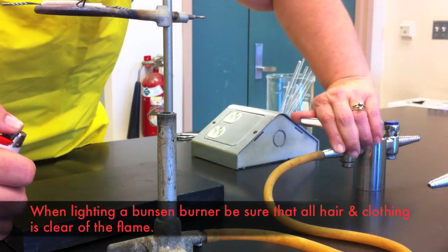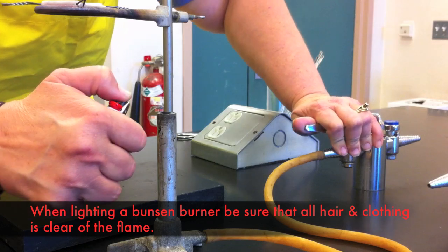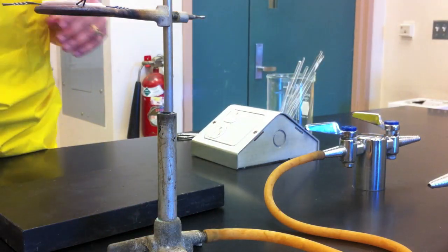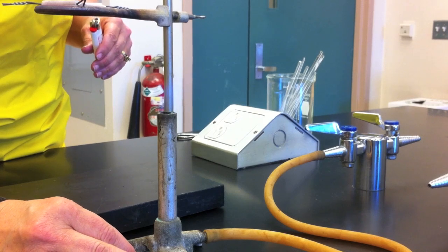When lighting a Bunsen burner, ensure that anything flammable such as hair or clothing is well out of the way. Turn on the gas flow and then bring a light, match or lighter towards the end of the Bunsen burner and it should ignite.